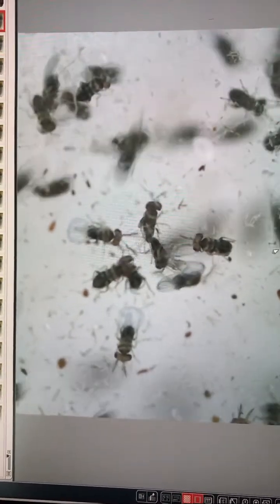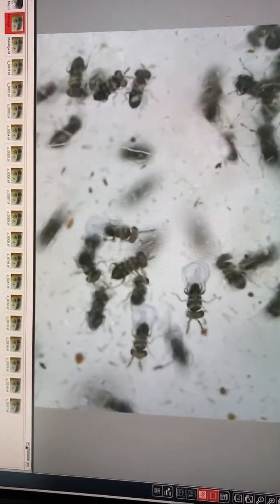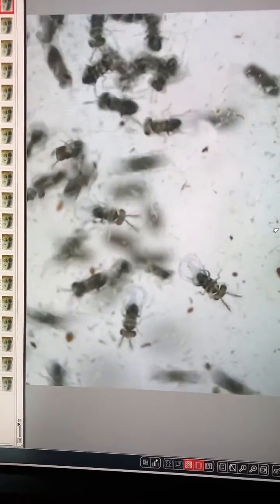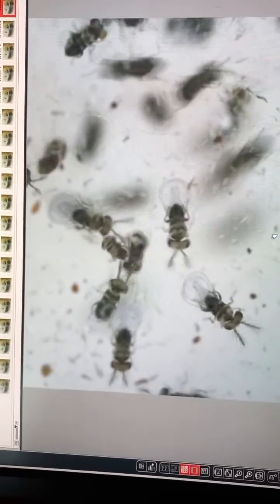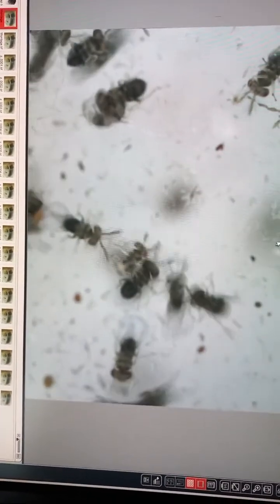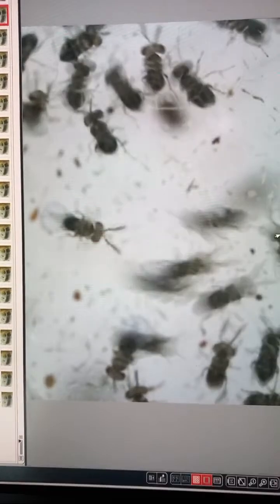Again, in the central part you can see the left part, this is a female, in the right part this is a male. Two mating individuals all together, just now we're just crowding around. Some males in the central part with long antennae with seta, with long setation on antennae. And the most important morphological feature for identification, this is a male genitalia of Trichogramma, which can be visible only under the microscope, under the magnification 1000 times, much bigger than now at the present moment. So I can watch male genitalia under the microscope on the full screen. So magnification should be at least 1000 times.